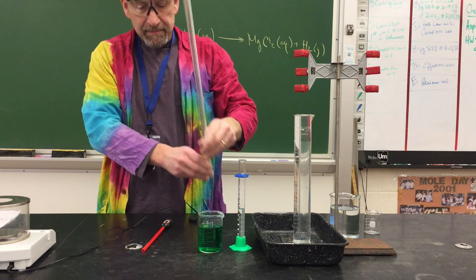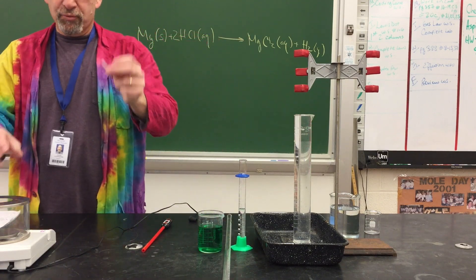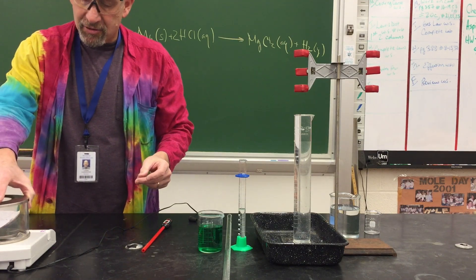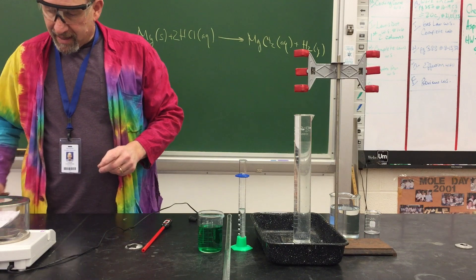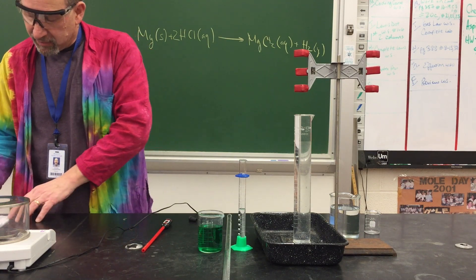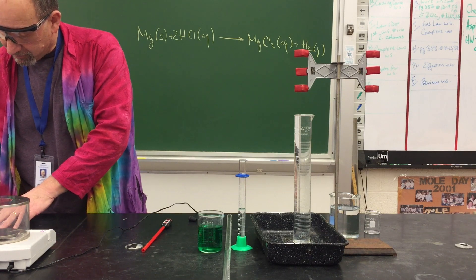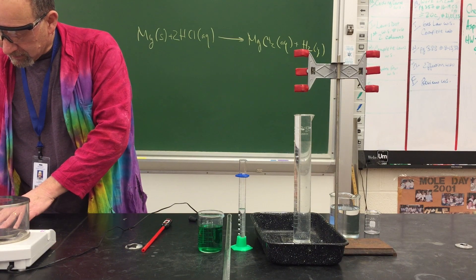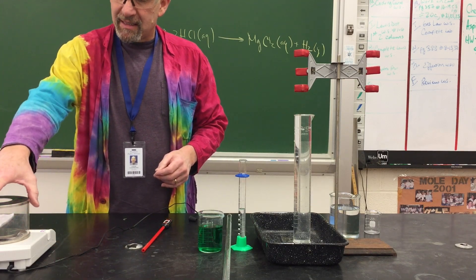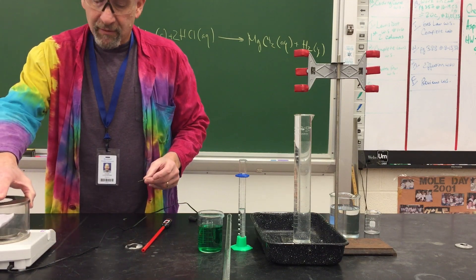To get started, I'm going to take a pre-cut strip of magnesium and measure its mass using a three-digit balance. The mass of this strip of magnesium — record this in your data table — is 0.039 grams. Even though we're only at two sig figs for the magnesium mass, we will use calculations to three sig figs for the rest of the experiment.